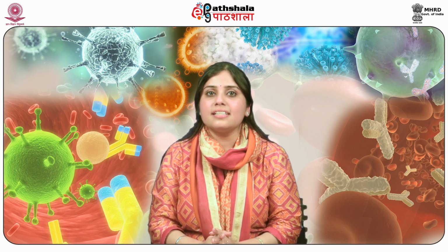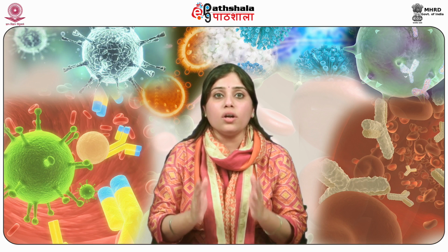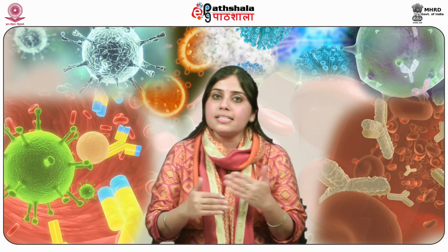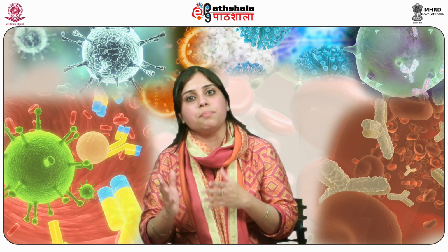Coming to the technique surface plasmon resonance or SPR. SPR is a non-invasive optical technique that involves label-free means of real-time tracking of binding of an injected analyte to an immobilized biomolecule.